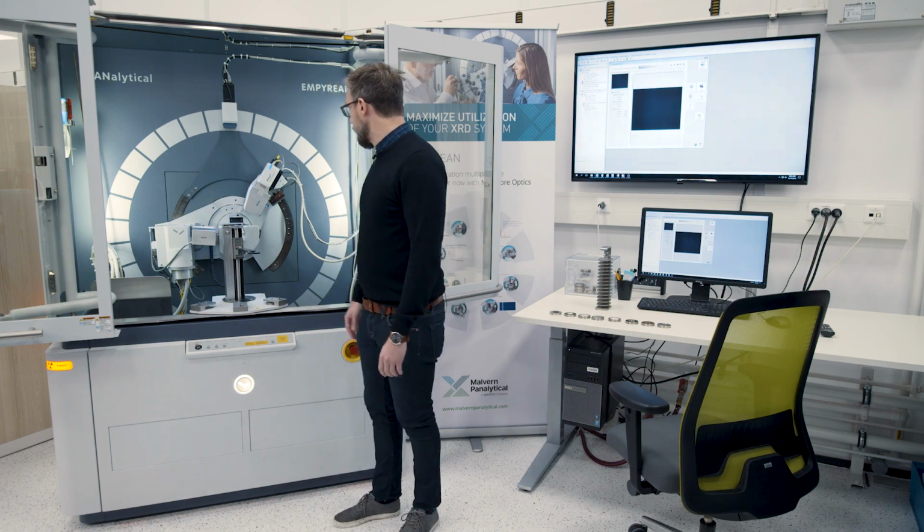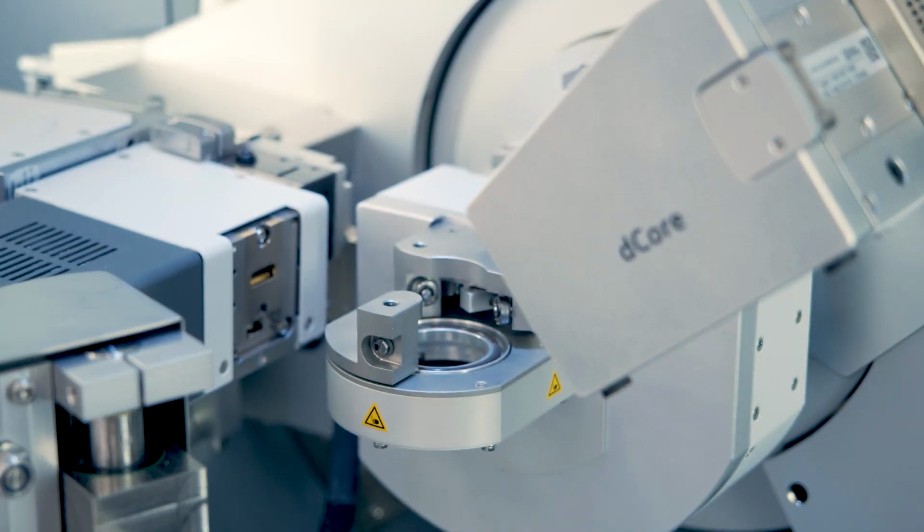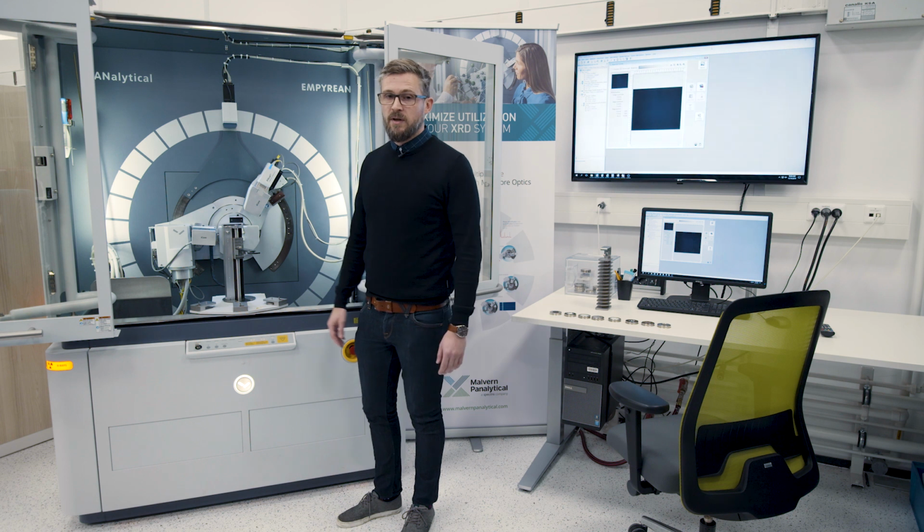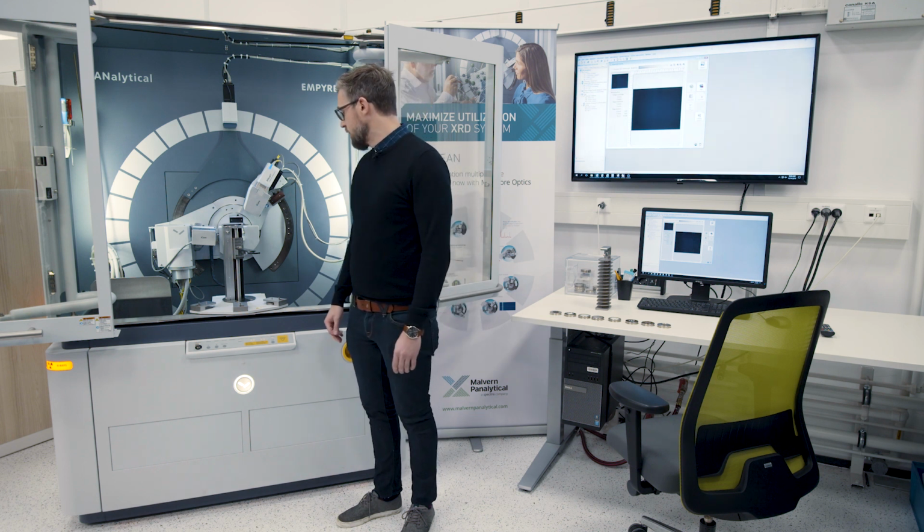In addition to that, we have a reflection transmission spinner that is conventionally used for powder diffraction measurements and an automatic sample changer that allows you to measure all the samples without having to load after each measurement.